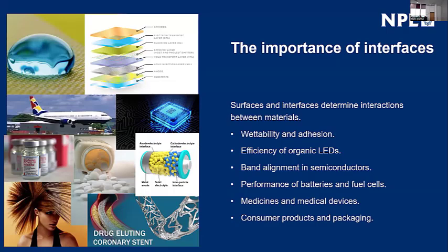I've got another list here, and I know that we're going to have talks on semiconductors and batteries and fuel cells later on. But even things like hair gel need surface analysis. You don't get your hair sticking up like that without a bit of surface interaction. So the need for surface analysis is ubiquitous, and there are many methods by which you might measure surface chemistry and surface properties.